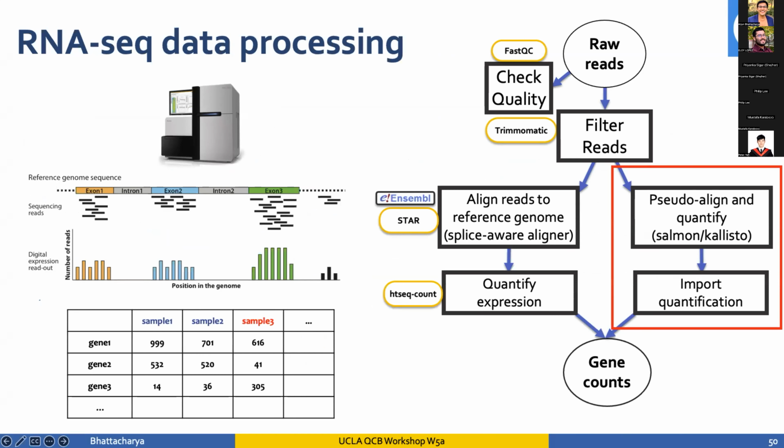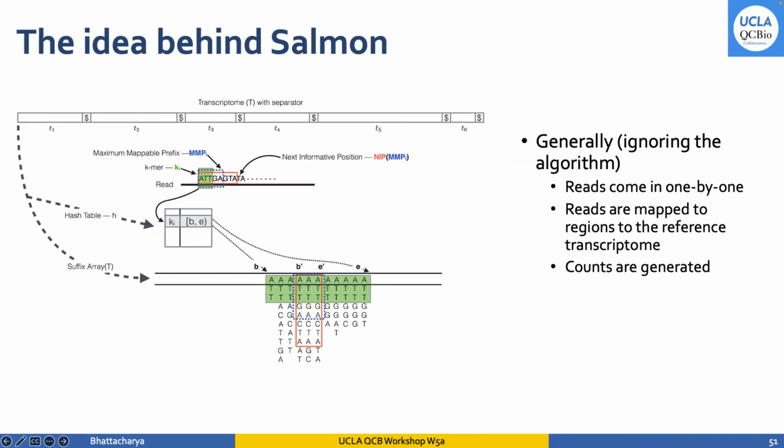I think essentially Salmon goes past all these really long checkpoints that are done in the other program. Okay, yeah. So I guess I can go back to give a little more intuition on what the algorithm is doing here. So we have a reference.